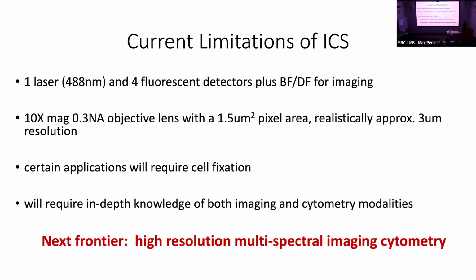And as I mentioned, I think the next frontier is really high resolution, multispectral. So that's using more than one fluorophore, maybe up to 5 or 6, as James and Akash have recently developed, and applying that to imaging cytometry.